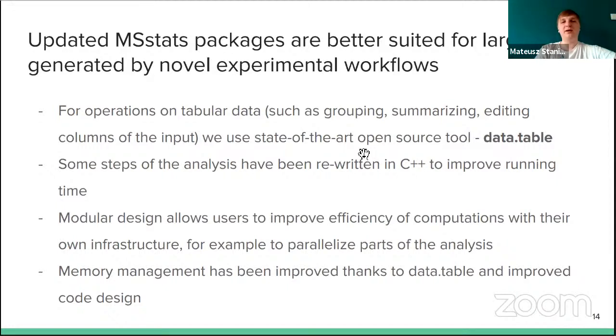Second of all, by giving a chance for really large data sets to parallelize some steps of the analysis, namely summarization itself, that is done for each protein separately, and group comparison, which is again done for each protein separately. And also, we were able to improve the memory management.